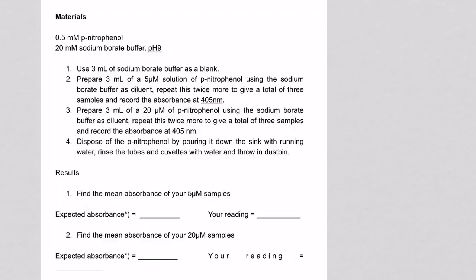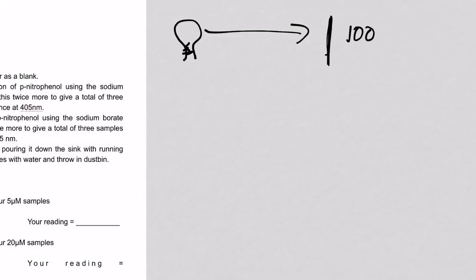Yeah? And these spectrophotometers actually allow you to produce a specific wavelength. This wavelength or this light then will be absorbed by a certain compound that we use, and the light detector at the other side will detect less of the light. So this would look a little bit like, here's the light bulb. It sends out the light, and here is the photodetector. And it measures, let's say, 100%.